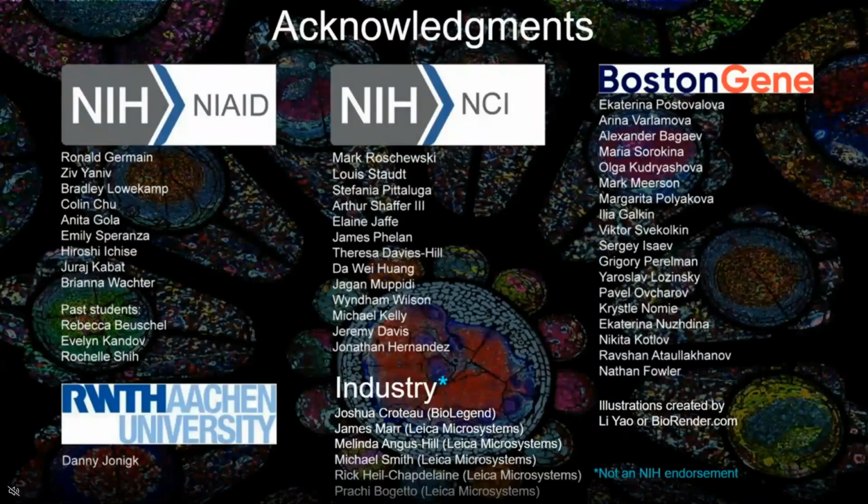Instead, we do sequential separation. We choose our fluorophores carefully, and we do dye compensation. So to get that high number of markers in a cycle, it is how you set up the image. You can do confocal, wide field, Cell DIVE, and we want to publish how we set up our image configurations for the confocal and wide field and display that on the knowledge base soon. There's a great postdoc who's working on the dye separation to provide more details on how to do that. So no, it is not. That's a long answer, and no, the Cell DIVE is not why we use that. And we've used many, many instruments, and we have people using other microscope manufacturers.